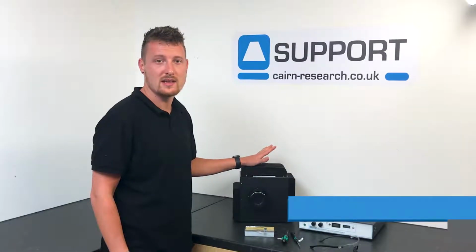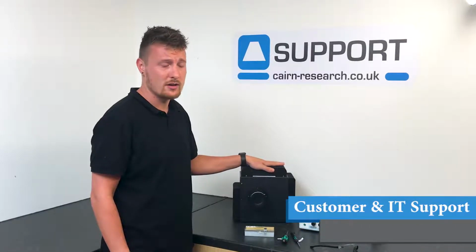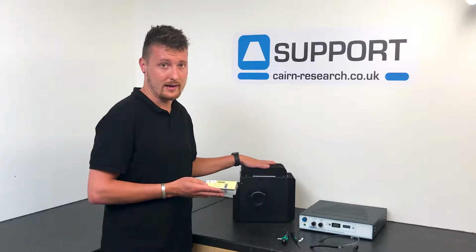Hi, my name's Adam from the Tech Support Department at Cairn Research, and today I'm going to show you how to install a 75 watt lamp into our Cairn Lamp House.